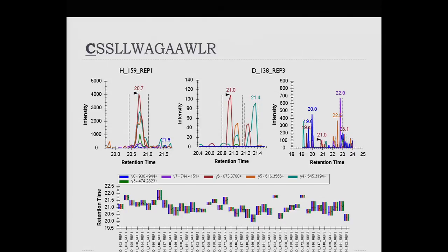I showed you this same data in my first presentation for a different reason, but I had been told over and over again by Mike McCoss and Daniela Tomazella how important it was to randomize, and how in early experiments they'd failed to randomize, and how that had really caused some problems. And so my heart kind of sank when I looked at this data and saw that it wasn't randomized, because they had said, oh, it's randomized.